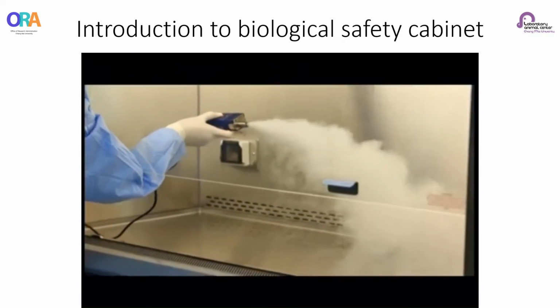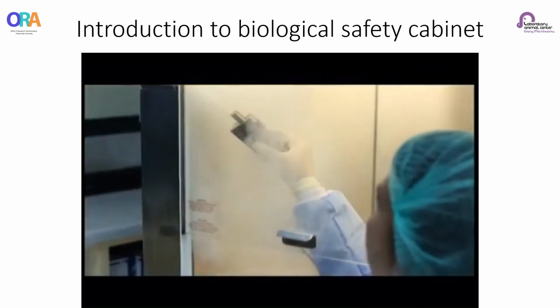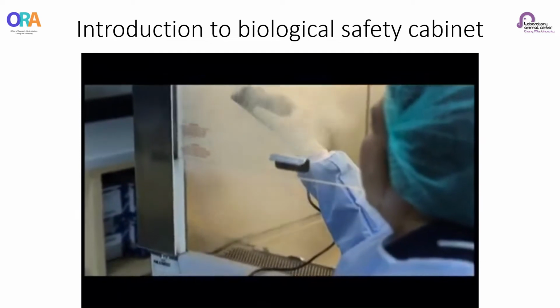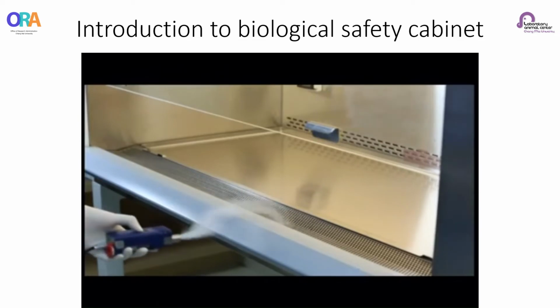BSC field certification tests must be performed on each cabinet at the time of installation and at least annually or whenever the HEPA filters are changed, maintenance repairs are made to internal parts, or when the cabinets have been moved.